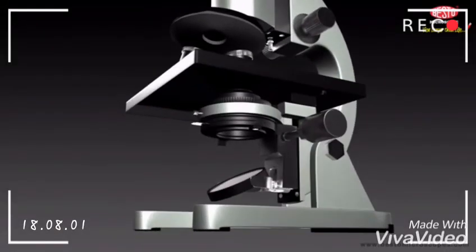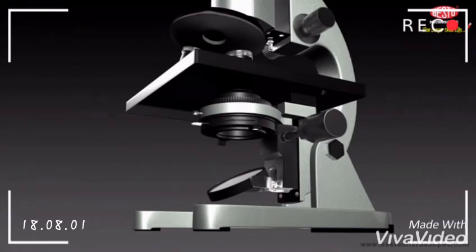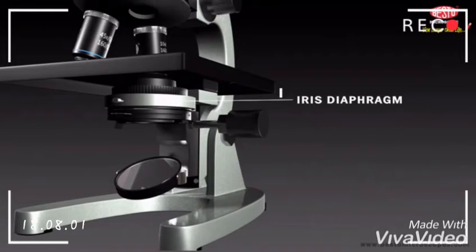Beneath the stage, in almost all microscopes, is a condenser with a standard diameter of 39.5 mm, which collects and concentrates the light before it passes through the sample. The iris diaphragm is used to control the diameter of the light transmitted onto the specimen.